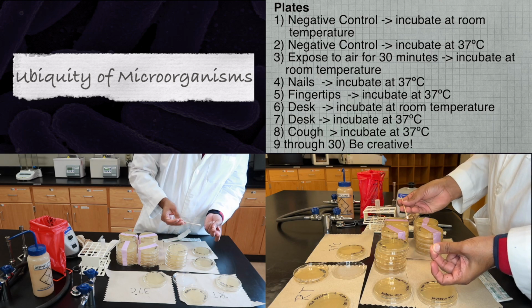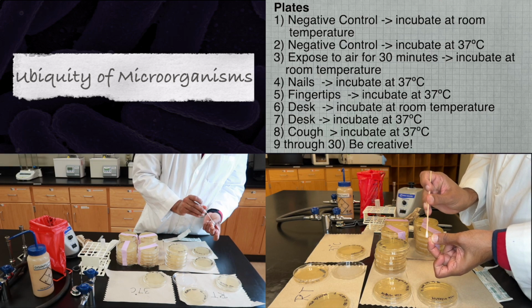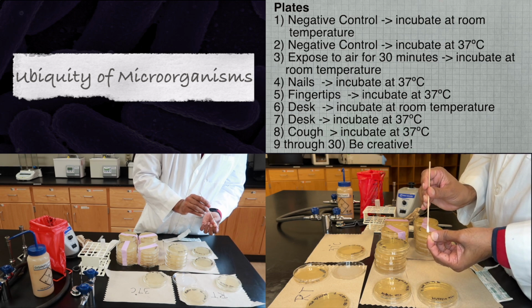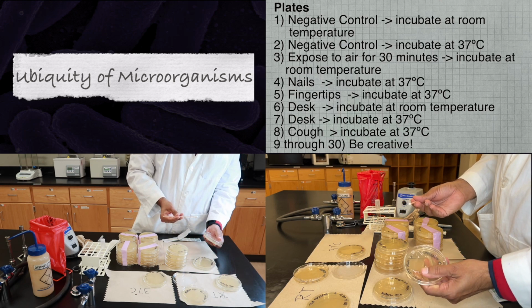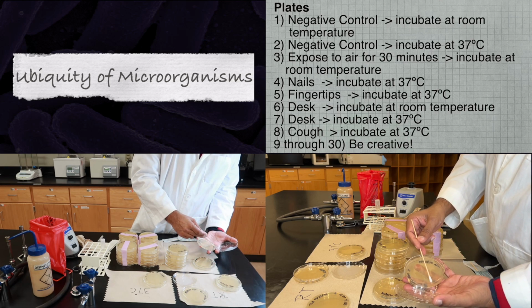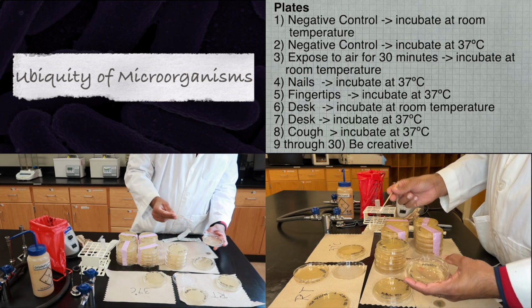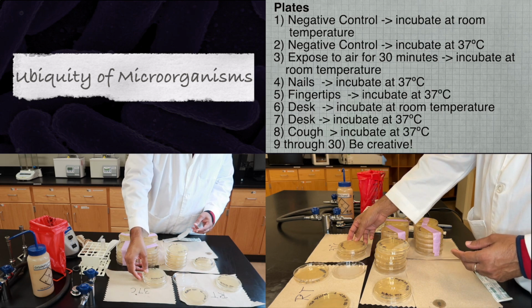Then please proceed to thoroughly wipe underneath your fingernails using the sterile cotton swab. After this, you will then open up plate number 4 and wipe the sterile cotton swab across the surface of the agar plate. This plate will then be incubated at 37 degrees Celsius.